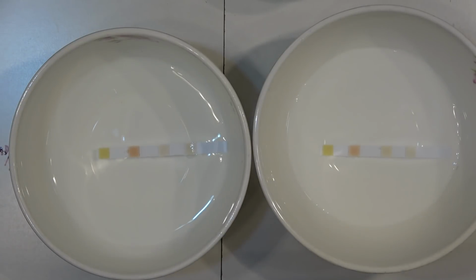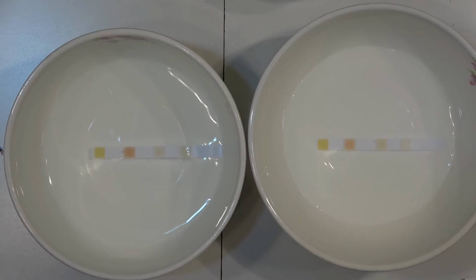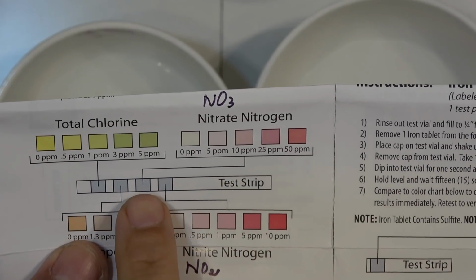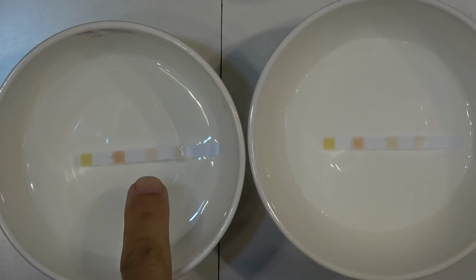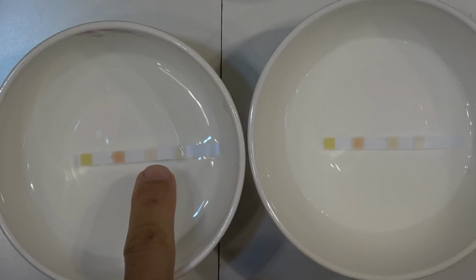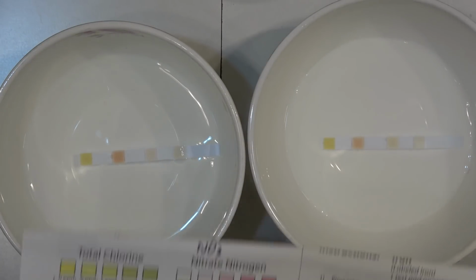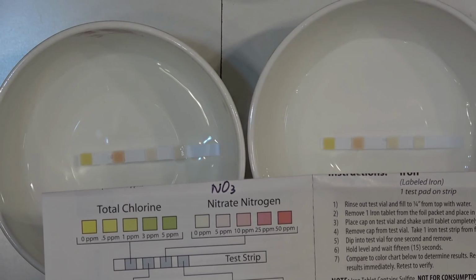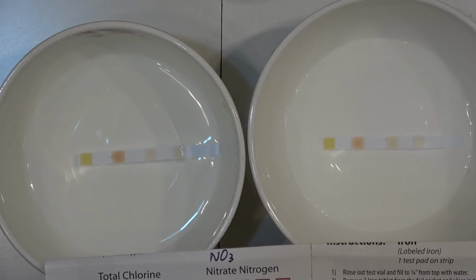The nitrate and nitrite level is pretty similar on both samples. So according to the chart here, the third one is nitrate, the fourth one is nitrite, and it looks very pale. That's nitrate and that's nitrite. It looks pretty pale to me. So it looks like there's little left. Almost no nitrate and no nitrite.